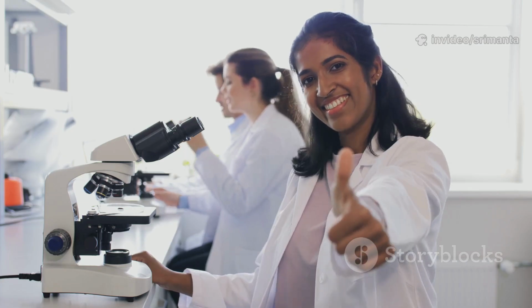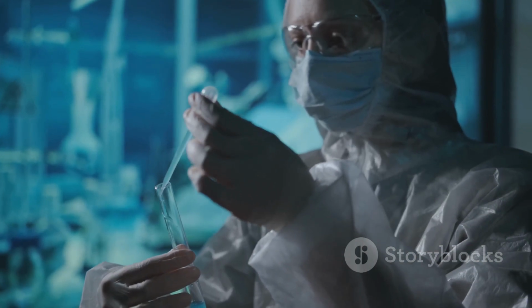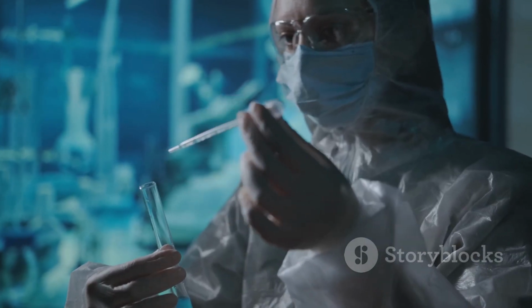If the stain from our sample is lighter in color than the stain from the standard, or if there is no stain at all, we can declare that the sample passes the test. It means the amount of arsenic in it is below the safe limit. If the stain is darker, the sample fails. It is a simple, visual comparison that holds the key to consumer safety. Consider it done.